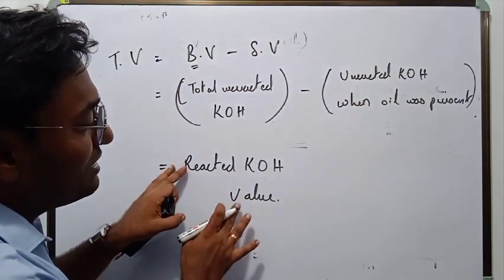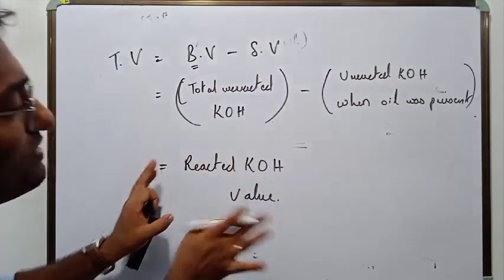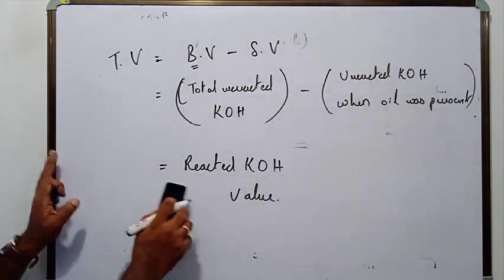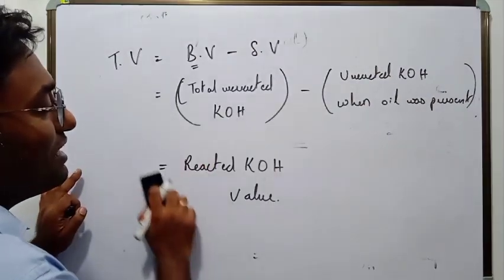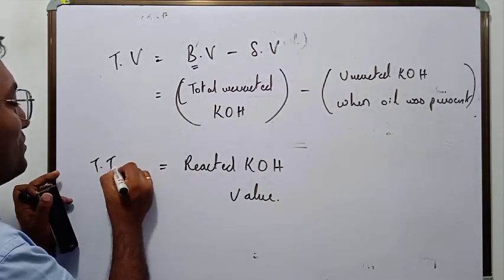Actually it has not reacted, but we assume so. That is how we get the reacted KOH value, which I will call the true titer value.